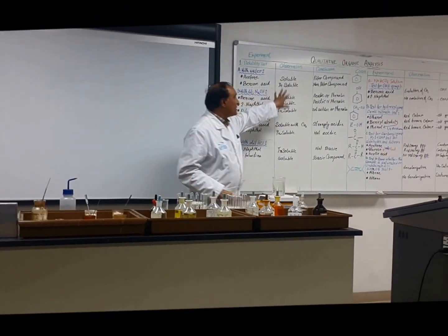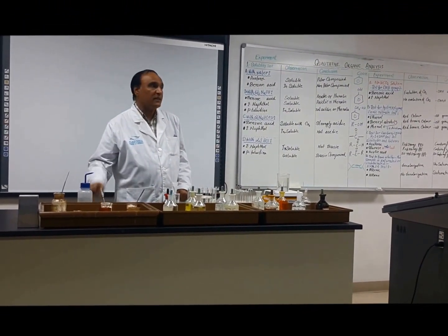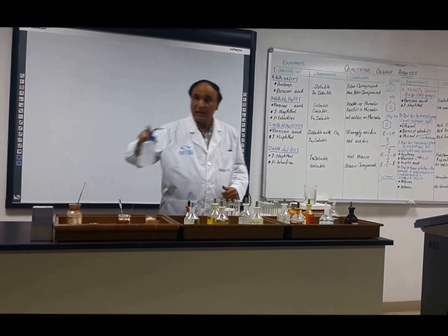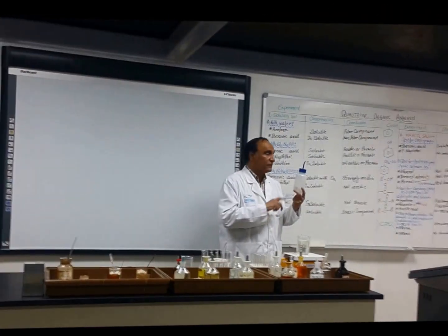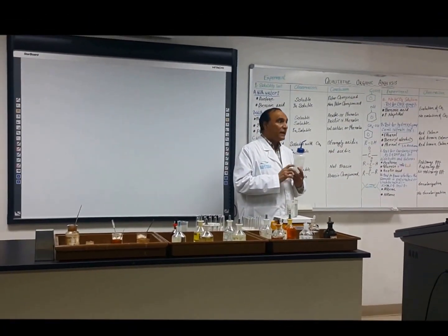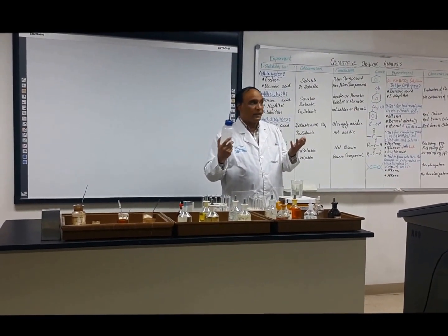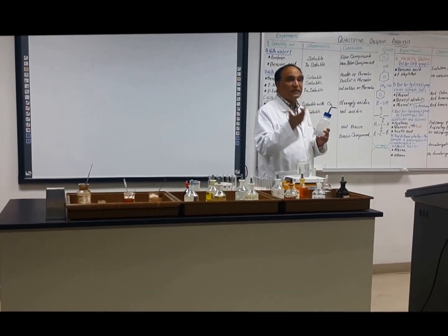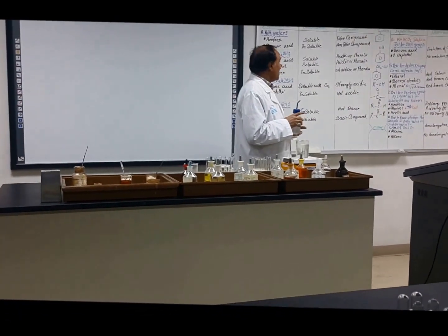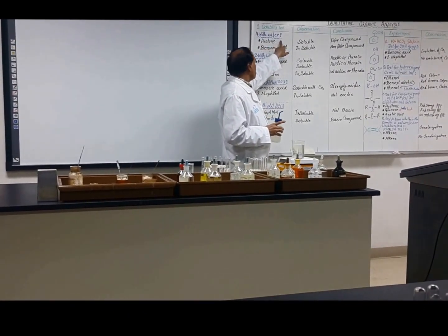It's about the solubility. Solubility gives us a lot of information. For example, if we dissolve something in water, you know water is polar. Anything which dissolves in water will be polar, and anything which does not dissolve is non-polar. Right? Yes. So we will check the polarity in the water.